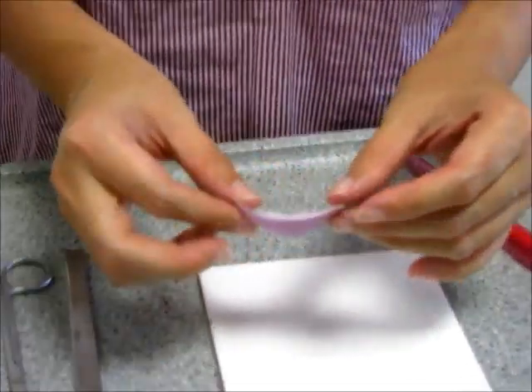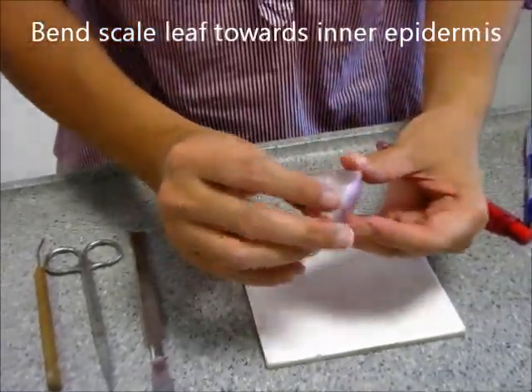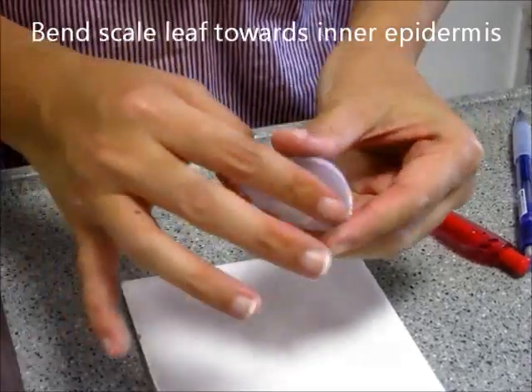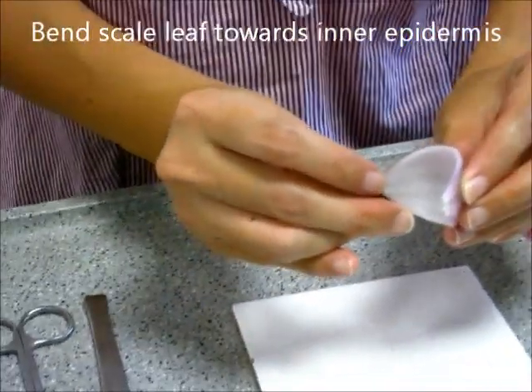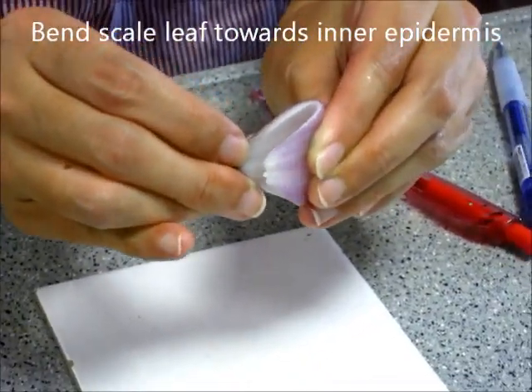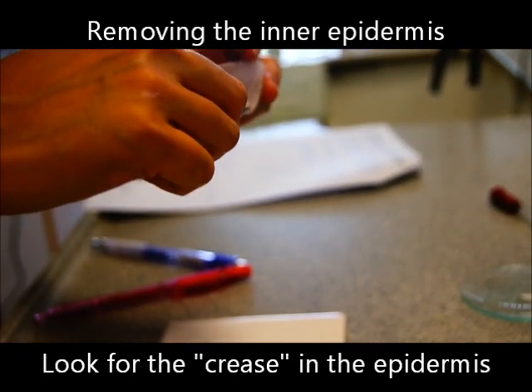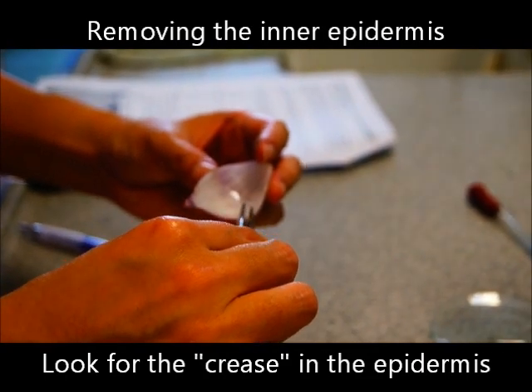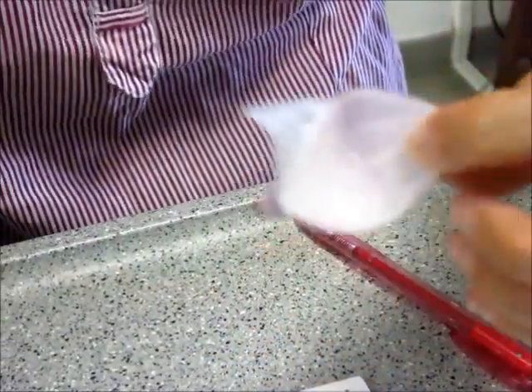First, we need to get this scale leaf of onion and we need to bend it towards the inner epidermis. Now, to tell where is the inner epidermis, there's one side that is more purple and more dry and there's another side that is more sticky and it's concave, right? So this is the inner epidermis and we bend the scale leaf towards the inner epidermis. So you hear this crunching sound. After you have bent the onion scale leaf, you will be able to see that now there's a little crease where you have bent it. And then if you peel the epidermis from the side, you will be able to remove quite a large piece.